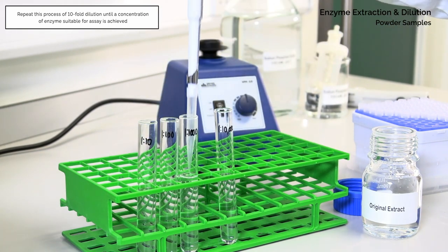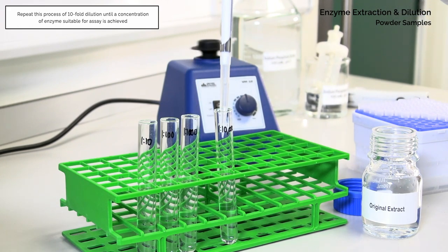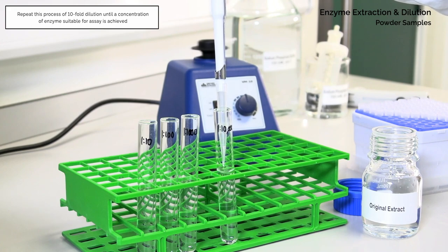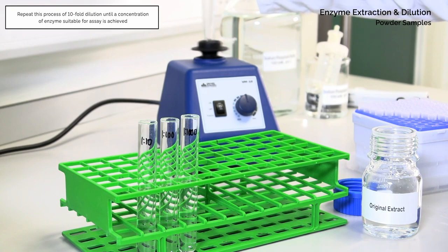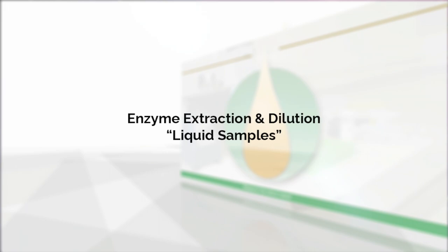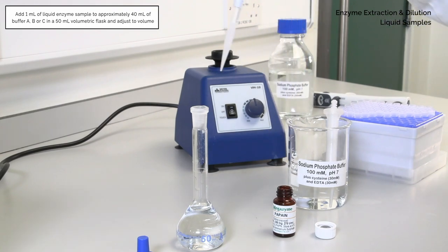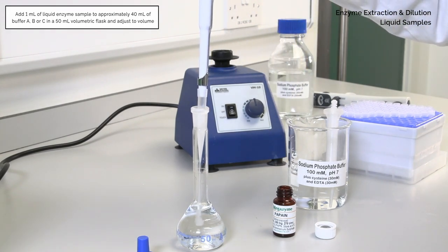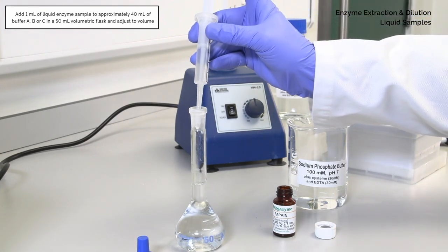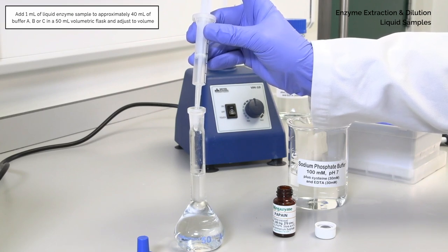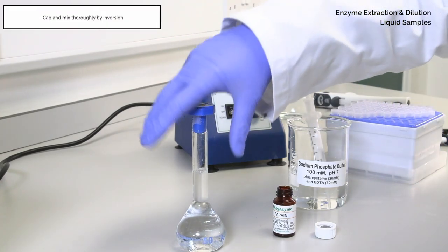In a positive displacement dispenser, add 1 ml of liquid enzyme sample to approximately 40 ml of buffer A, B, or C in a 50 ml volumetric flask and adjust to volume. Mix thoroughly by inversion.